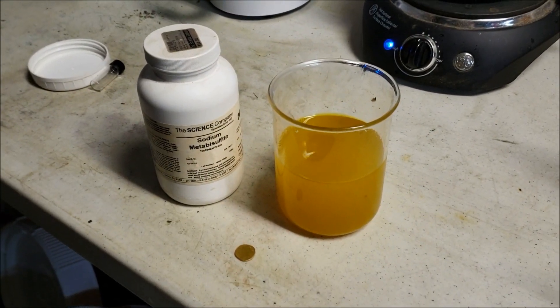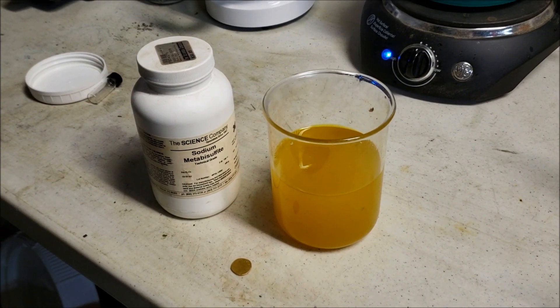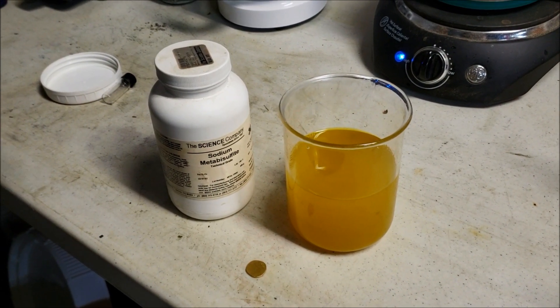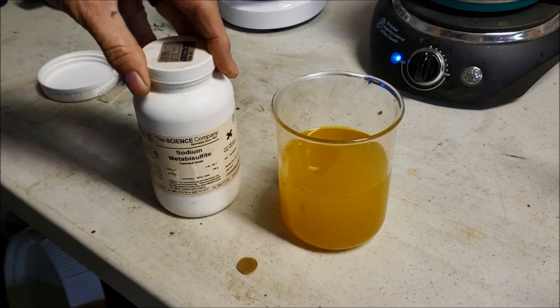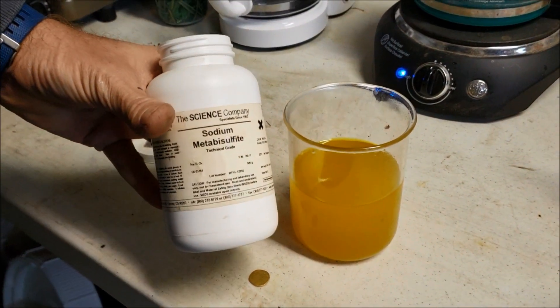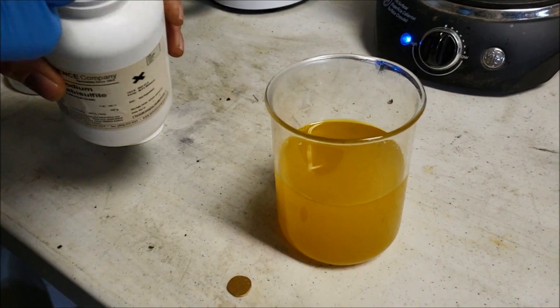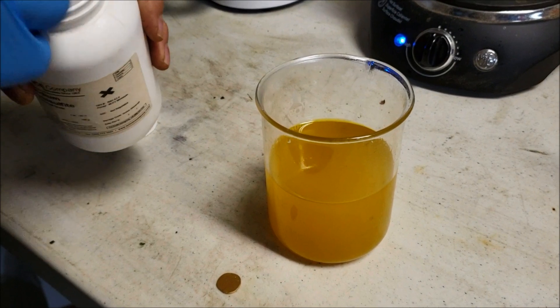Now that we've deNOxed it with the urea, we're gonna drop the SMB - make all that pretty brown dirt fall right out of this pretty yellow and get our gold back.